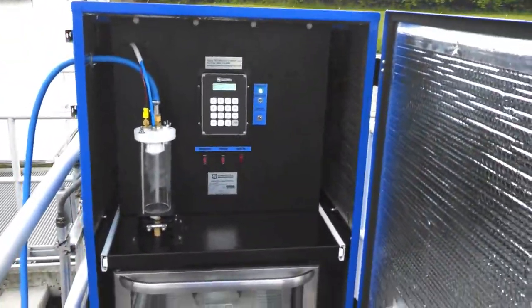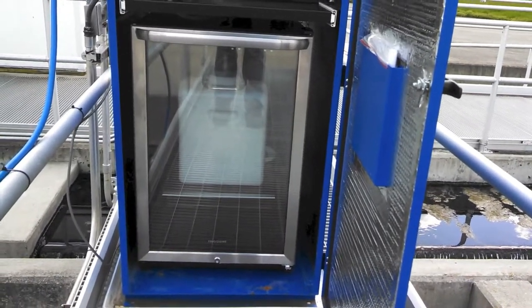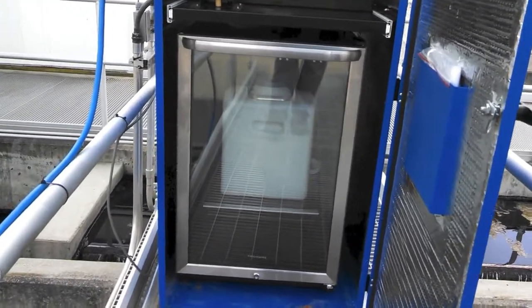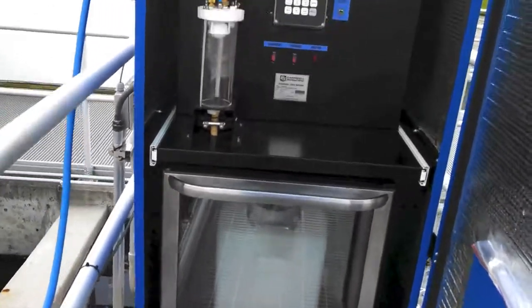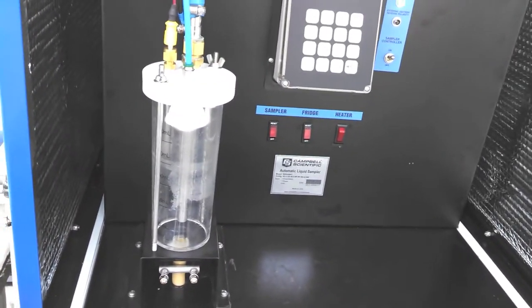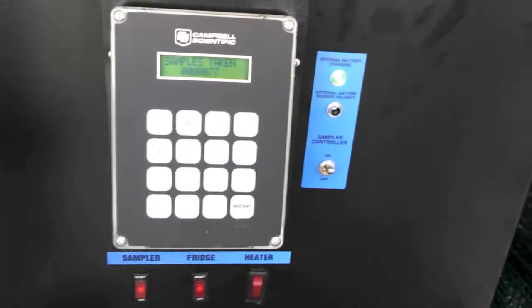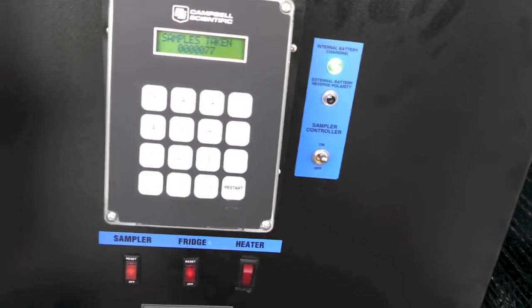This particular unit is set up with a glass stainless steel fridge and a 20 liter Nalgene container. There's a 500 milliliter sample chamber right here. We can see the controller, and this is also set up with the heater.